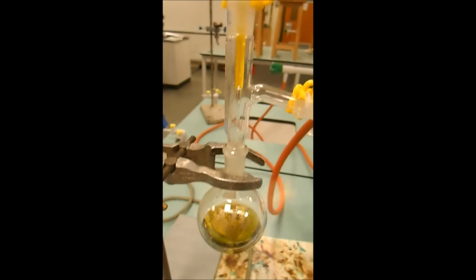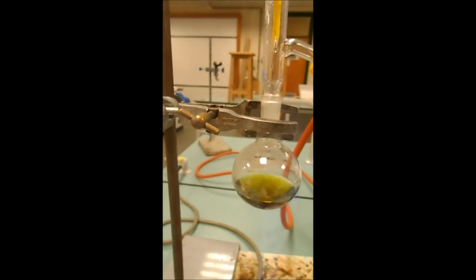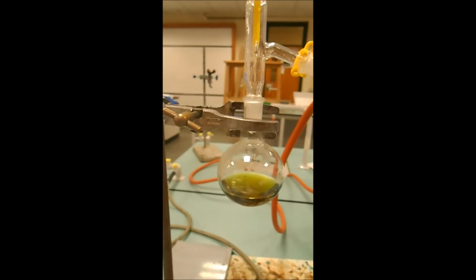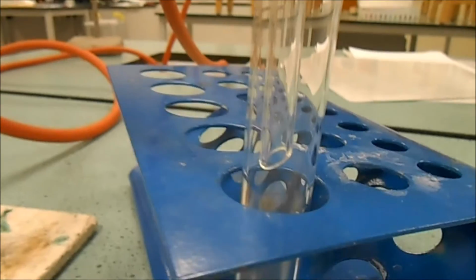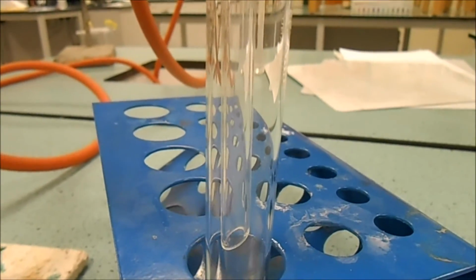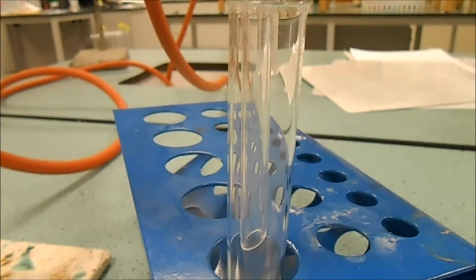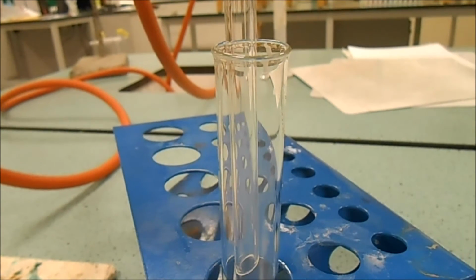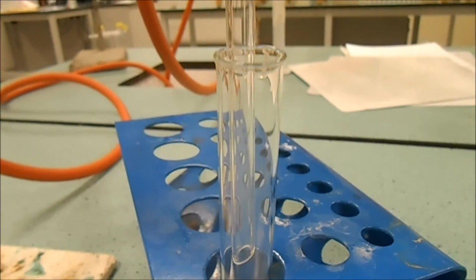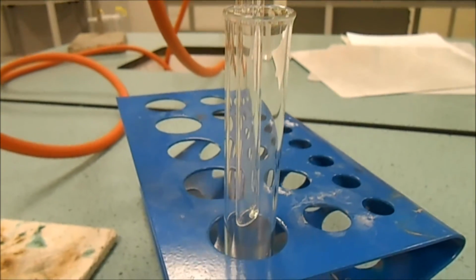Now down here we've got another change. You can see that that is now definitely not as orange as it was before. That's now gone a green colour. Okay, and that tells me that the reaction is working. At the bottom, gradually, little bits of my product should be coming through. There's one.